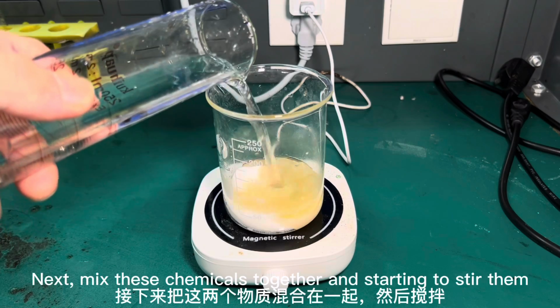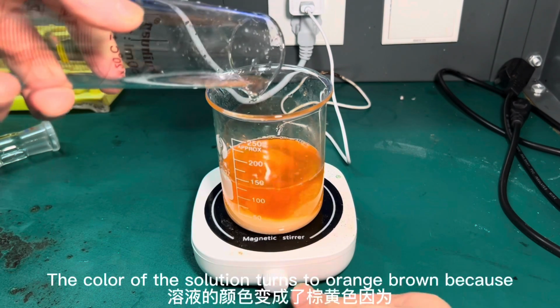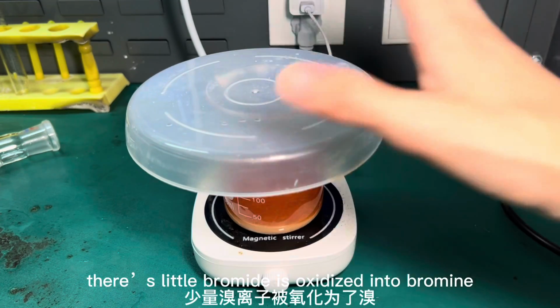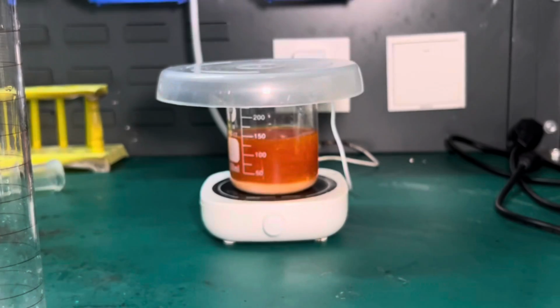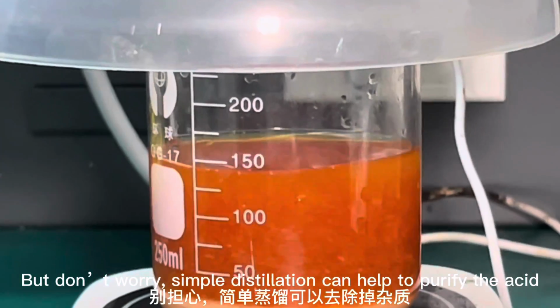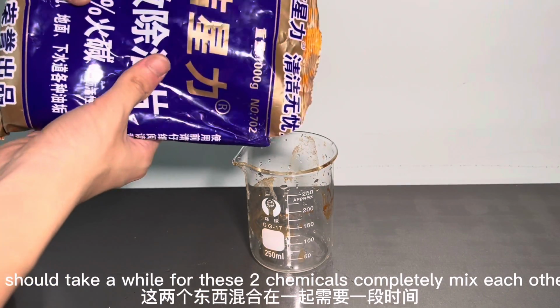Next is to mix these two chemicals together and start stirring them. The color of the solution turns orange-brown because a little bromide is oxidized into bromine. But don't worry, simple distillation can help to purify the acid. It should take a while for these two chemicals to completely mix with each other.